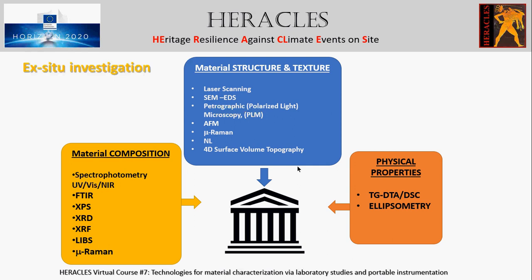For the material structure and texture, we have the confocal laser scanning microscopy that can generate accurate three-dimensional images revealing detailed information regarding structures characterization. This technique is well suited for the cultural heritage materials since it is non-destructive and non-invasive, while allowing surface topography of samples.